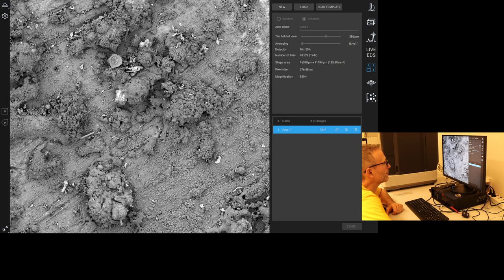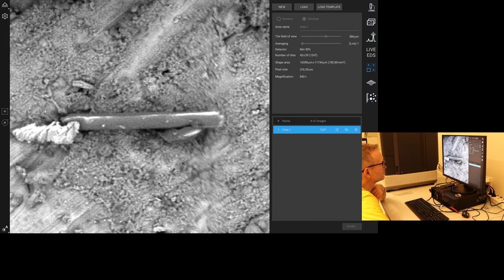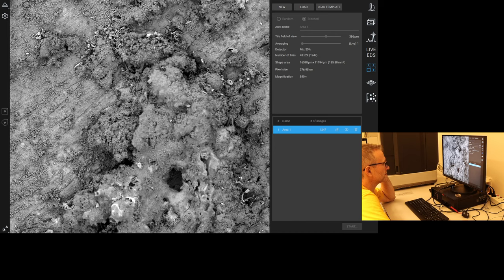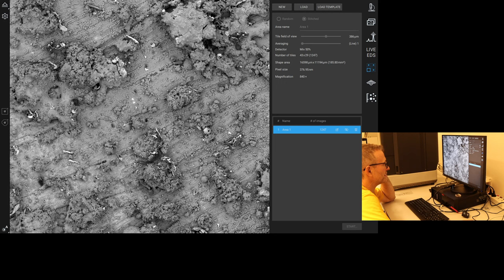Oh dear. Another one of these silicon rich. They're very consistent in their size, aren't they? Well, have to find another one that's in a good spot to look at. One there, but it's in a shadow probably. One there, definitely in a shadow. Be interesting to see if we find one actually coming out of the structure. They're very straight. Here we've got a very hollow ball there. Look at that one.